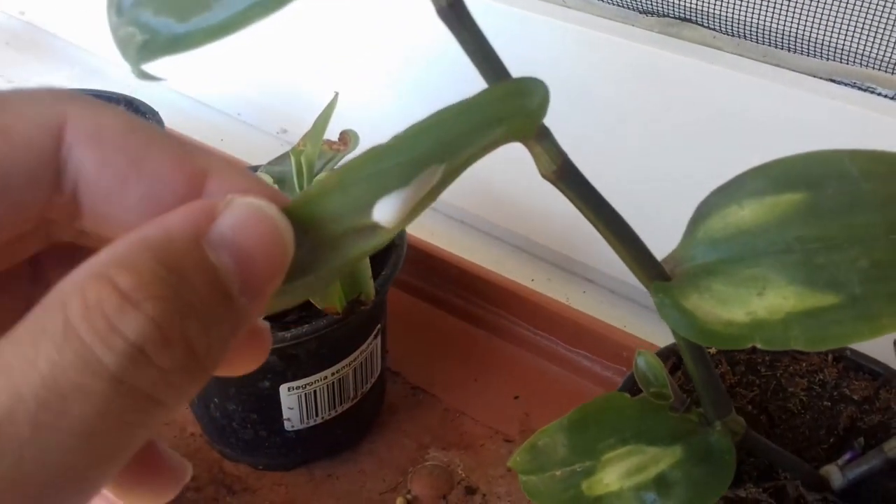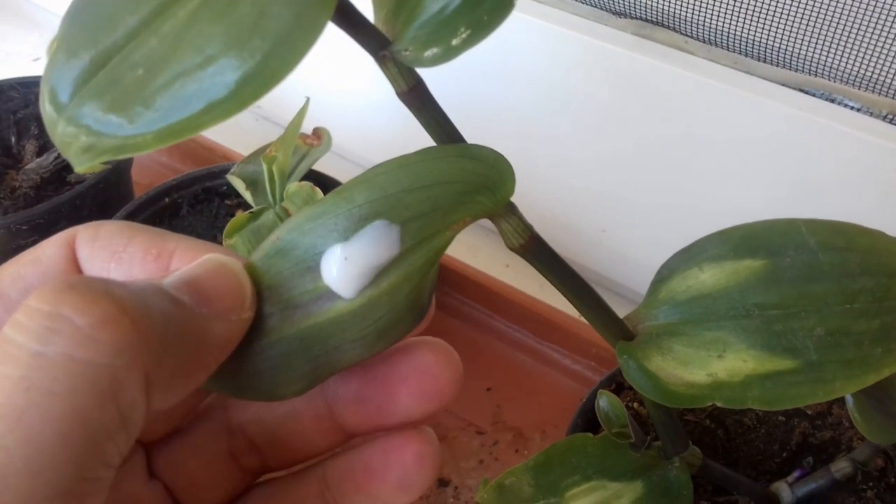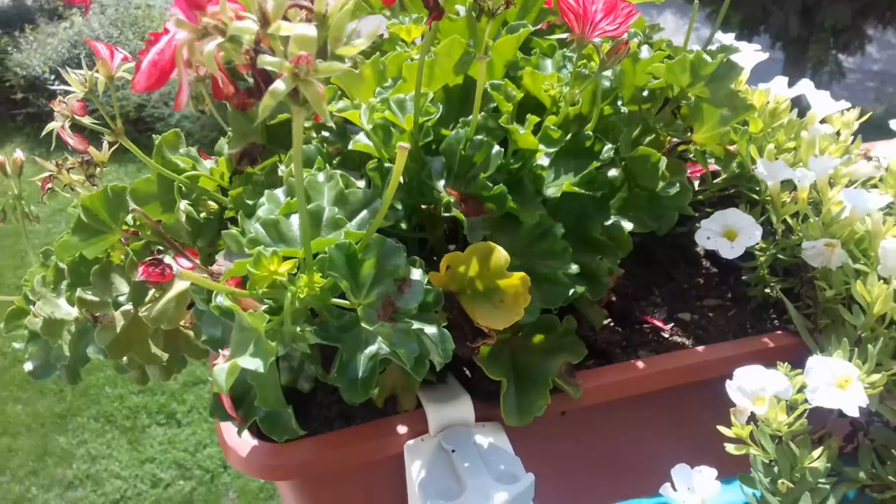Just to be on the safe side, I also applied some glue here — I'm going to try this plant and these here as well.